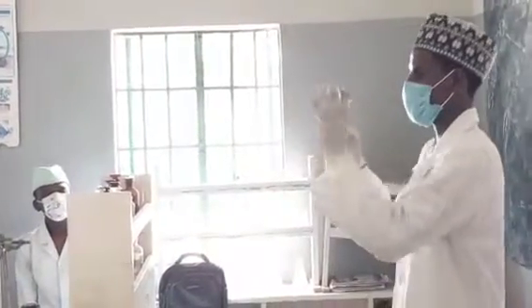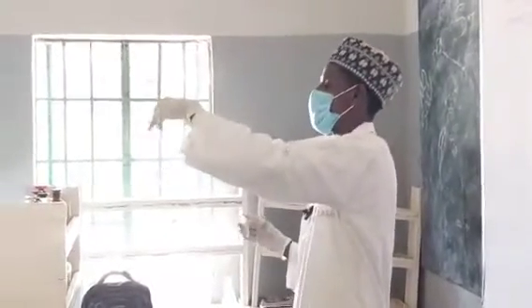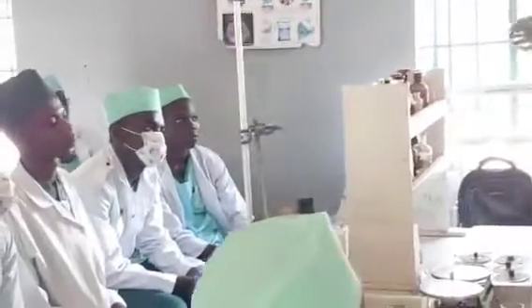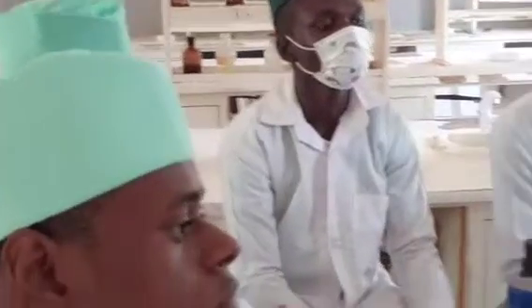As you can see, you can see through it. That is why it is called a watch glass. It is used to measure out solid samples. You can see through it, from the word watch. So it's called a watch glass.